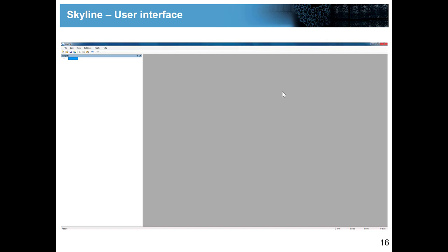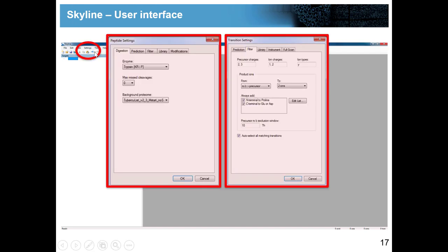The very first thing that you will always have to do when you start a new project in Skyline is to go up here to these settings. There are these settings buttons and there you find these peptides and transition settings. This is really something I can just emphasize right from the beginning: you should always take a very good look at the settings.